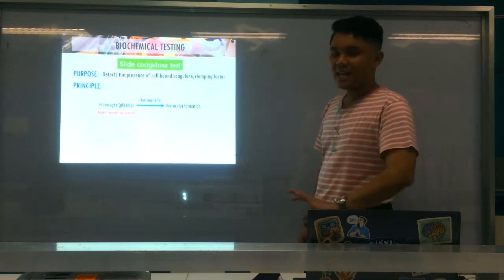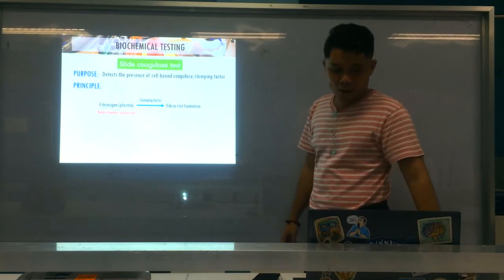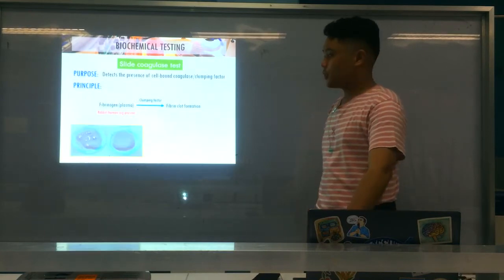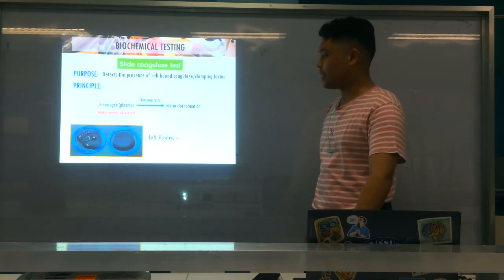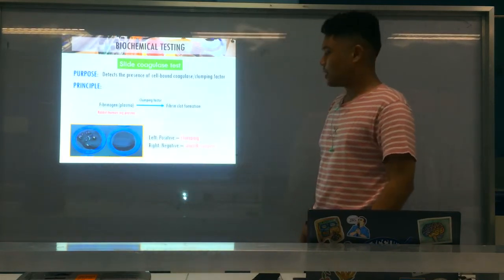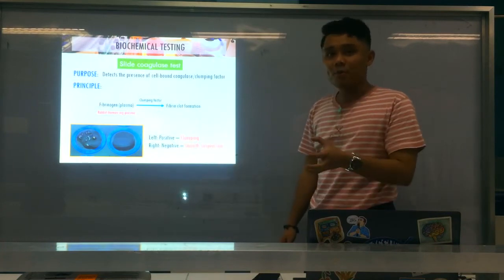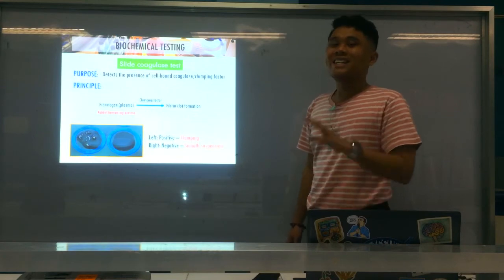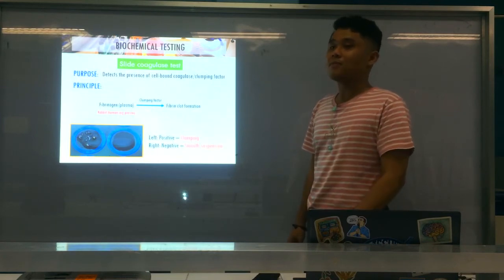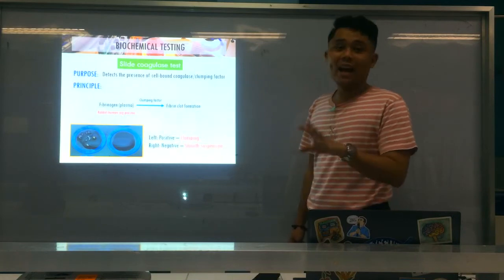Again, obsolete method na, dili na kaayo gina-perform as according to Mihon. Dapat definitive na we go to tube coagulase. Alright? So here's an example. Ayan. So ang positive nato is clumping. As you can see na yung mga kumpul-kumpul. Alright? And negative is smooth suspension. Alright, that's for slide coagulase. Unsa gani na type of coagulase atong gina-detect, it's your cell-bound coagulase or your clumping factor. Don't worry, naa ko'y mnemonic ana later.